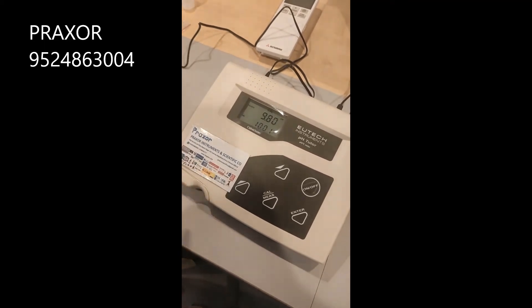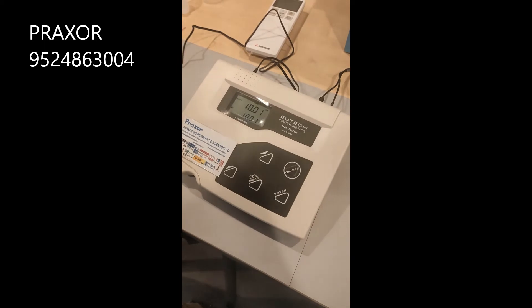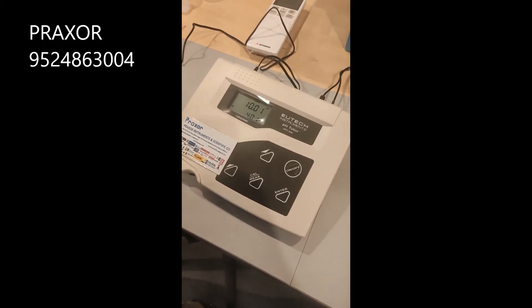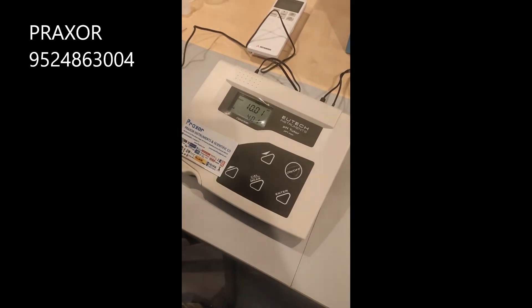The pH 10 calibration is done and the ready signal will appear. Press the Enter key. After that, it will ask for another solution — if you want, you can also calibrate pH 4.